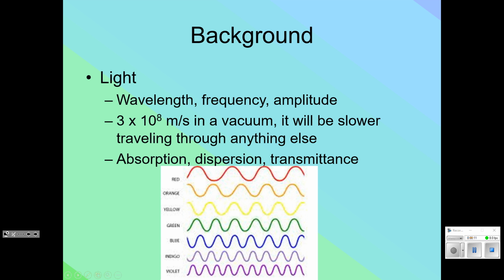Light travels in waves, like I've shown in the picture on the bottom of the slide here. Sorry that yours is in black and white, but mine's in color. Frequency is how often the waves occur. So a long wavelength has a low frequency. We're actually covering this exact same stuff in Chem 1 right now.